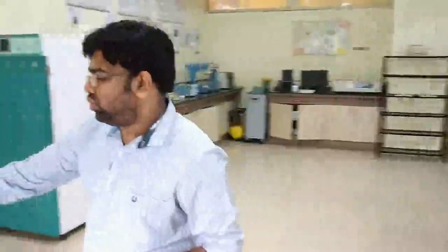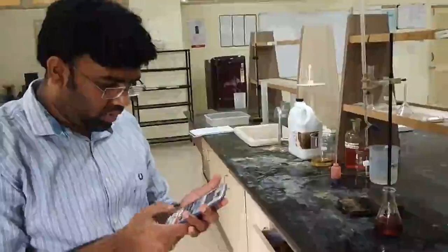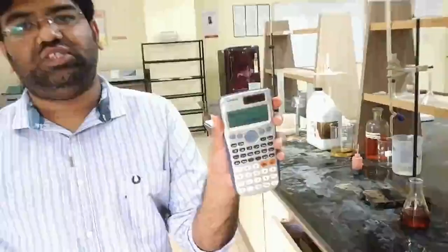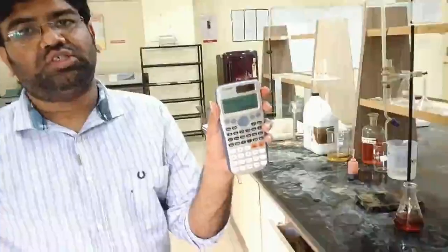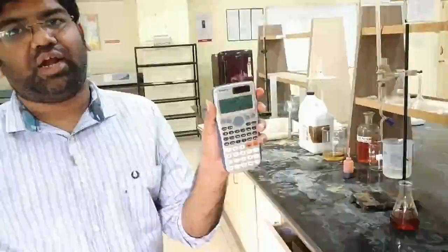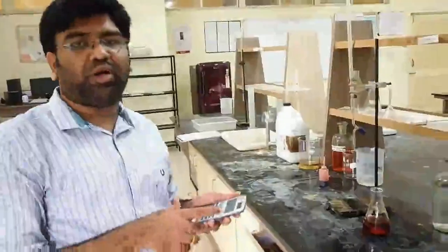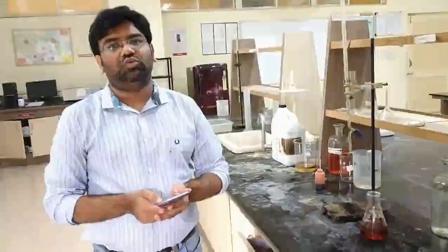So if we just do the calculation, it is 0.25 into 10, divided by 24.8, which comes out to be 0.100. So it is an exact normality that we have achieved of 0.1 normal, right? So 0.1 normal we have achieved, and this particular normality will be used for further calculations of the COD value.